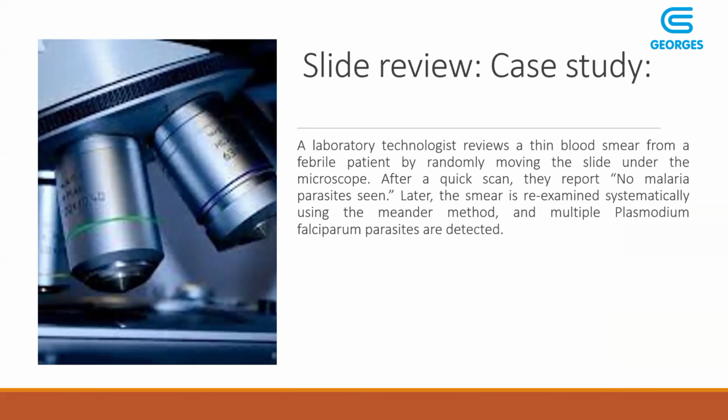So let's have a look at how we review our slides. That is, after staining the slides, how are we going to review the slides to ensure that we can declare a slide either positive or negative for malaria parasite. So here's a case where a laboratory technologist reviewed a thin blood smear from a febrile patient by randomly moving the slide under a microscope. After a quick scan, the report was no malaria parasite seen.